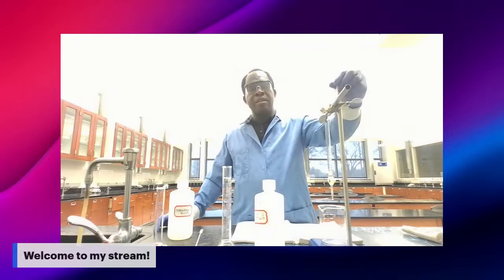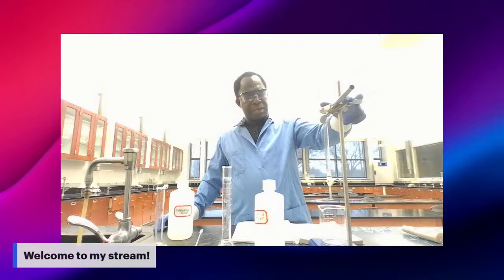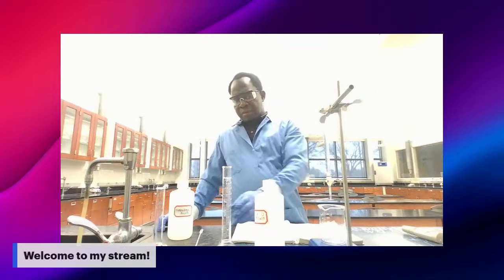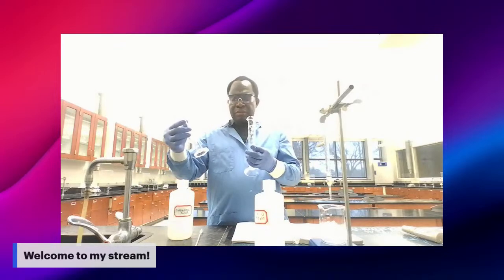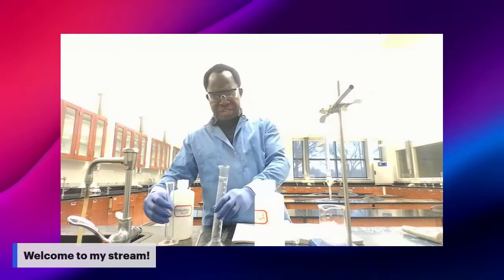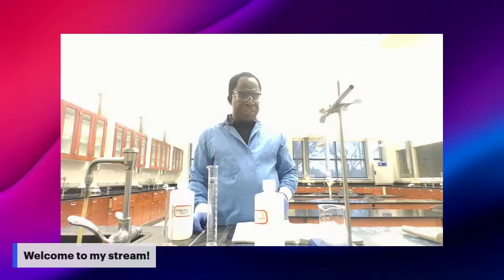You need a stand and the tube holder clamp here, and a 400 milliliter beaker, and you might want to use a 100 milliliter graduated cylinder, or you can use a 50 milliliter graduated cylinder, for your measurements.